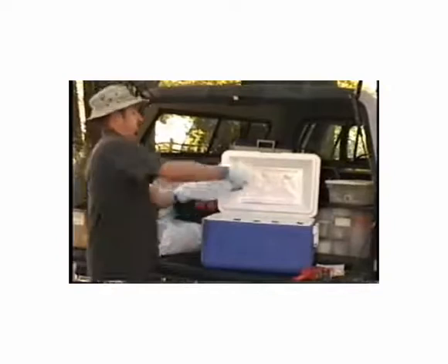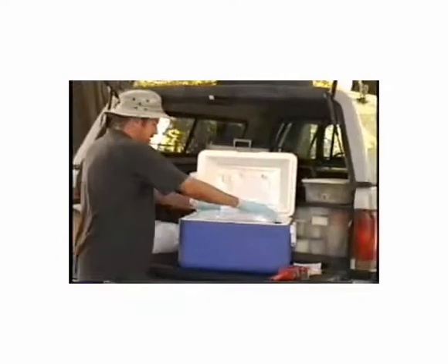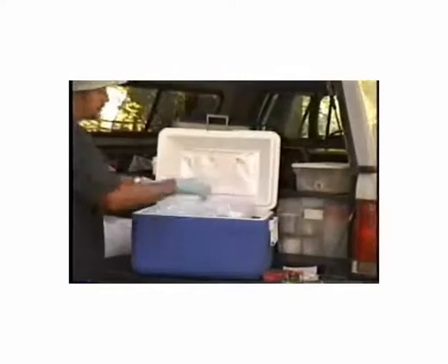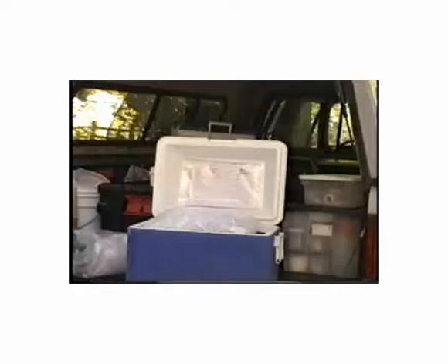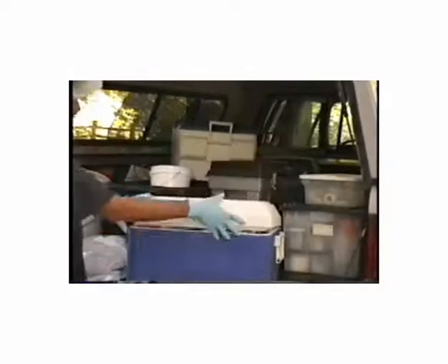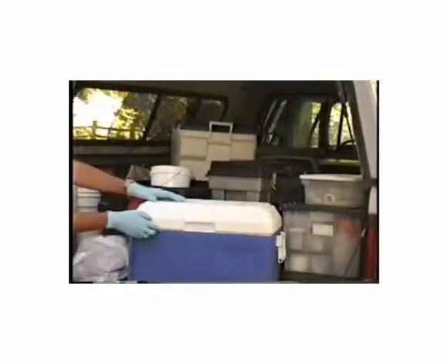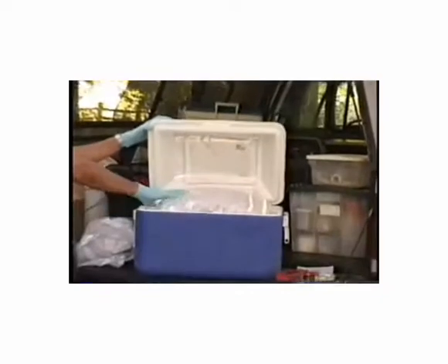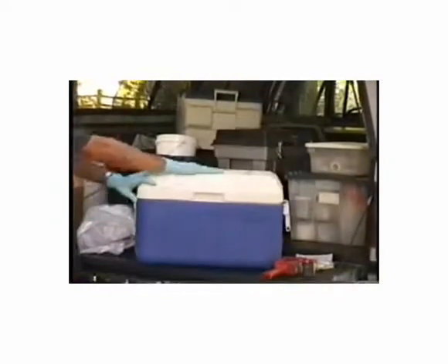We then place double bag ice on top of the samples, making sure that if there was any extra space around, we would wrap that with bubble wrap. Samples are ready to be shipped. We can then close the cooler, making sure that when we close the cooler it's not too compact, to where we're smashing any bottles or anything inside. This shuts pretty good.